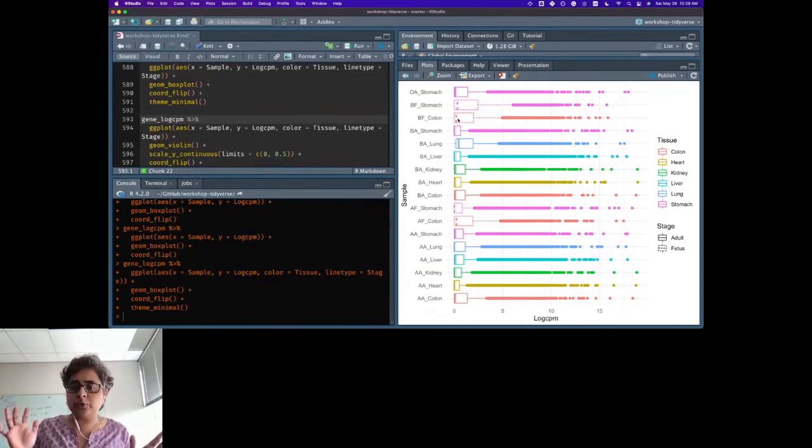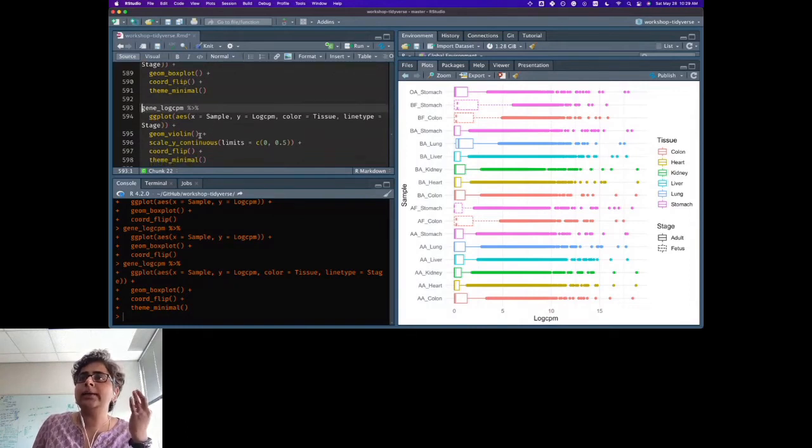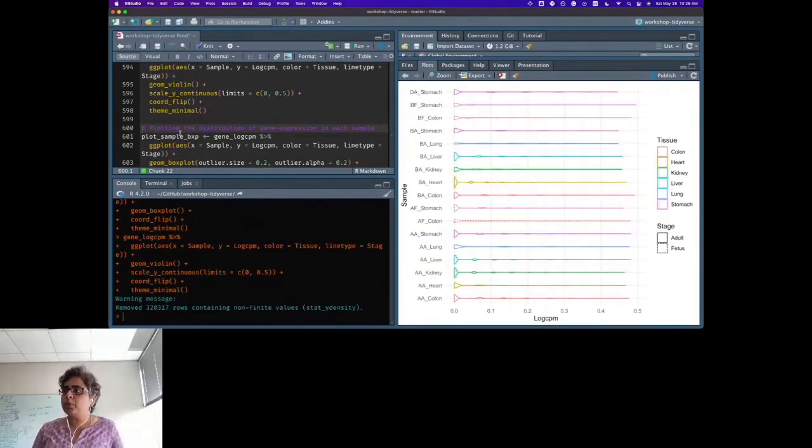So in a box plot, for those of you who have not made box plots, this line right here in the middle is the median. You have your 25th and your 75th quartile. You have the other plots, sorry, points. And here I think we've also plotted the outliers. Now I'm going to make a violin plot. Okay, let's see what the violin plot is looking like. Excellent question, Batul. Hope you all have some plots to also play around with.